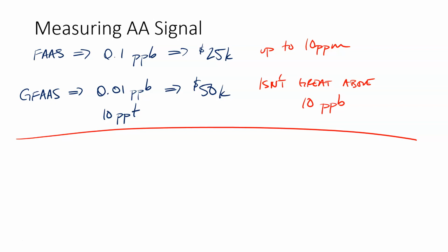When we think about AA, of course, we're going to use Beer's law, but the power from the detector, doing a background subtraction in AA can be pretty intricate, right? And so the power that reaches the detector, I'll say that's the net power or the total power, is equal to the initial power from our light source minus whatever power is actually absorbed by our sample, plus any light that is outside the bandwidth of our sample, but within the bandwidth of our monochromator.